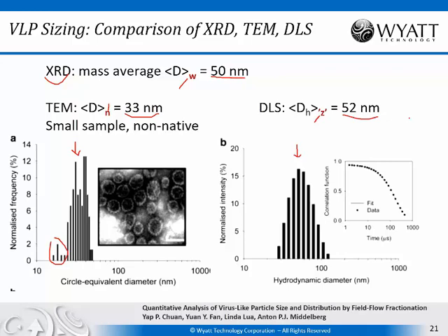And each of these gives you information which is important and relevant, with different advantages and disadvantages. TEM is a pretty involved measurement. You have to prepare your sample, you have to put it on a slide. There are a lot of things that need to be done.